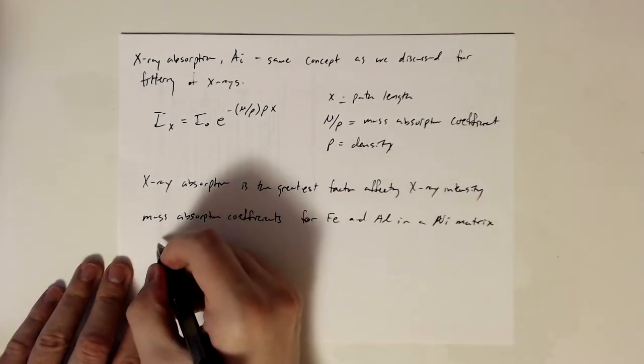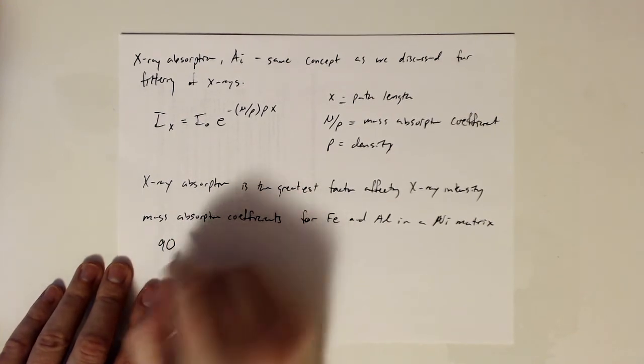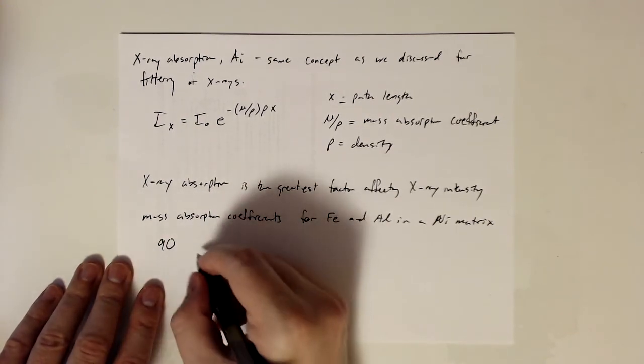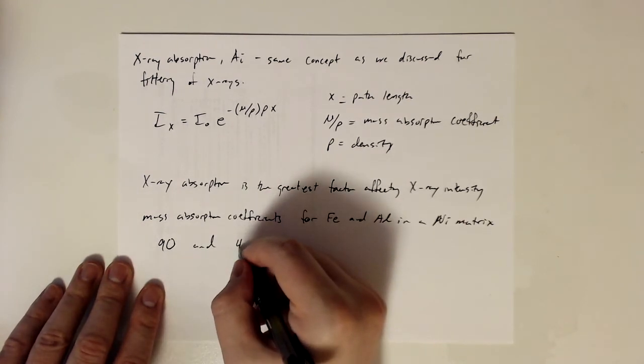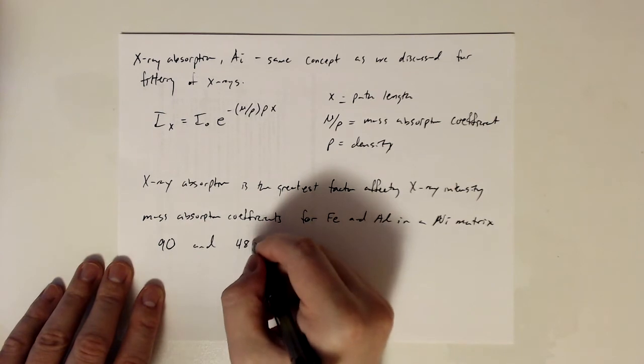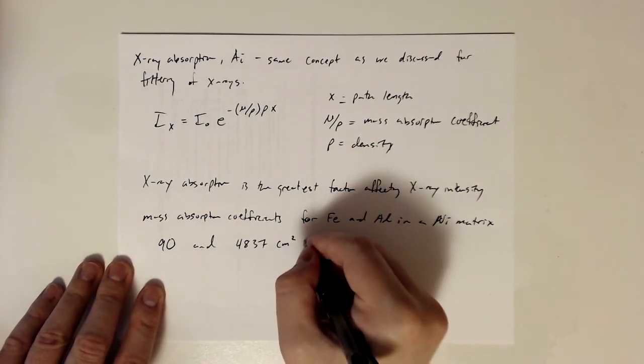If we look at these two numbers, for iron it's 90, and for aluminum it's 4,837, and this has units of centimeters squared per gram.